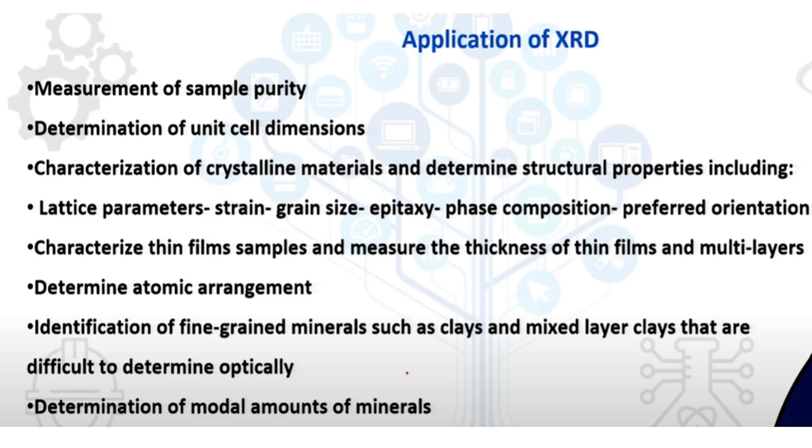Characterizing thin film samples and measuring the thickness of a thin film can be done through XRD. Also, the arrangement of atoms in a unit cell, in a crystalline material, can be determined. Identification of fine-grained minerals such as clays is also possible.